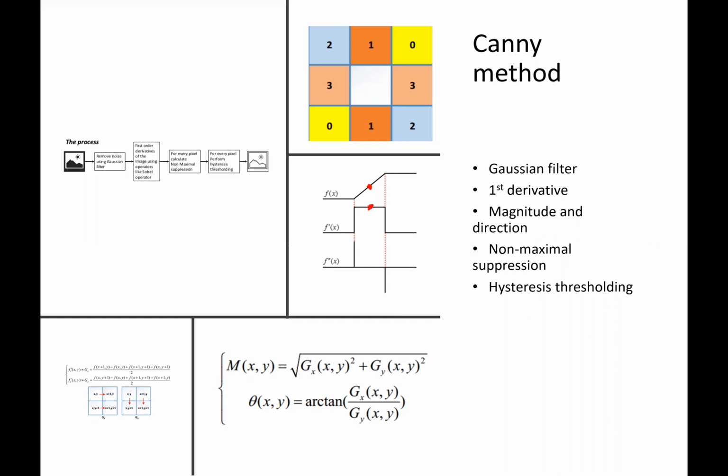So a point with a dramatic gray value change is also a point with high gradient in the first derivative picture. The point here has the highest gradient in the first derivative picture.